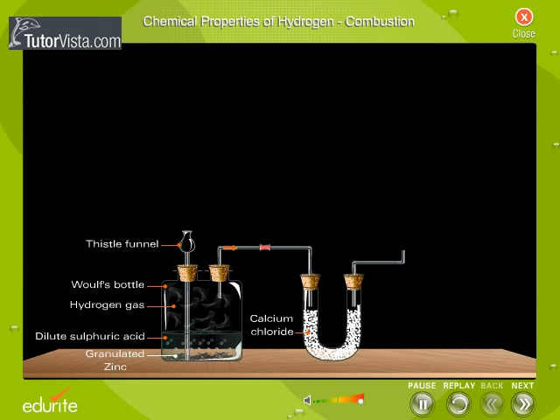Hydrogen gas evolved is passed through a U-tube containing calcium chloride. Calcium chloride absorbs the moisture present in hydrogen.